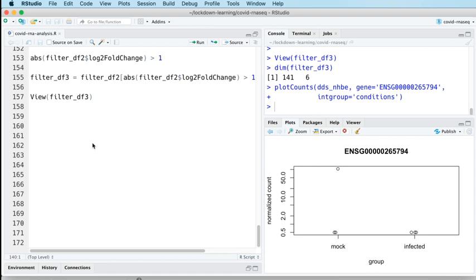Those two will be one from that DESeq2 provides us with, which is a method of visualizing all of the genes that we've tested for differential expression. And then I'm going to show you a second method for plotting a similar thing, but we're going to construct that plot ourselves. And then if we've got time, we will do a third thing as well, but we'll see how we go.